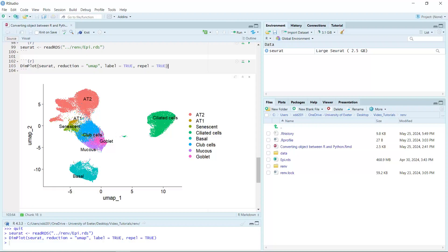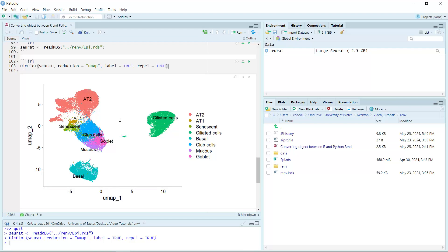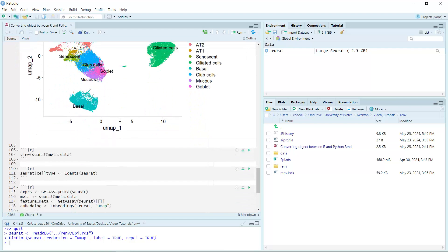We also have a senescent cell population in this dataset, because this dataset includes samples from the IPF lung. Next we can have a look at the metadata for this dataset.